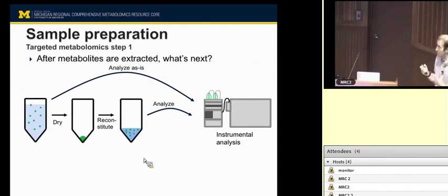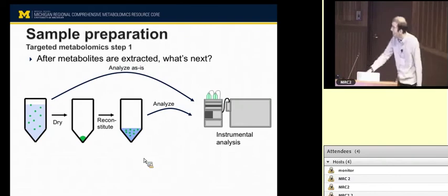Metabolite turnover is a big problem in aqueous solution if you're not carefully managing it or minimizing the time of exposure to it. So sometimes you may need to do some of the sample preps yourself, so you need to be aware of those. And also method development, which Steffi will talk to you about a little bit later on, that's a new add-on for this workshop, is sometimes needed to determine the optimal sample prep strategy. So sometimes that's an iterative process. So the take-home message is please consult the core before beginning this experiment as early as you can.